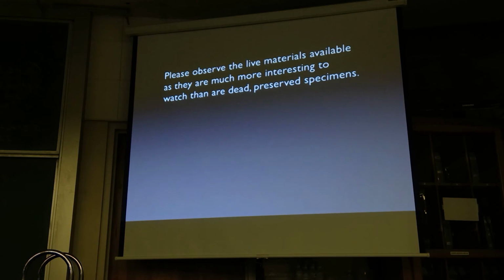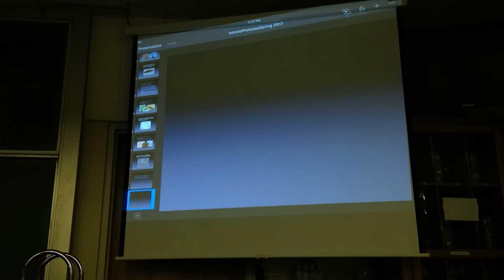So we get to look at dead preserved ones. We might have some live protozoa. I'll go look. But, so what are you going to do tonight? You can look at prepared slides. At this point, we've gone through cyanobacteria, fungi, and now algae, protozoa. If you want to look at the prepared slides, what I would recommend is to work in groups, and each person have a microscope and set up a slide, and then let other people look at it so you can get through a lot of slides quickly.